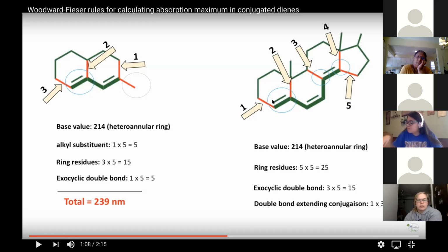Because it's a double bond coming off of this ring. And this double bond is coming off of this ring. But then this double bond can also come off of this ring. That's right, it's all coming back now.